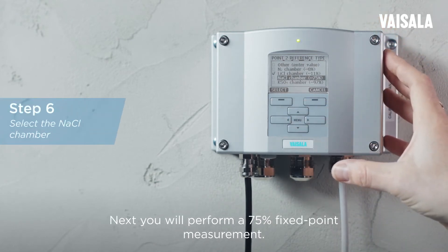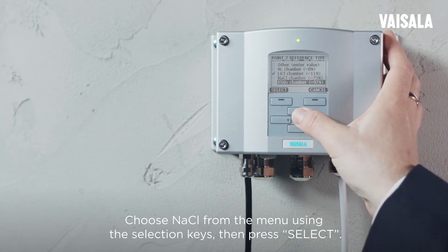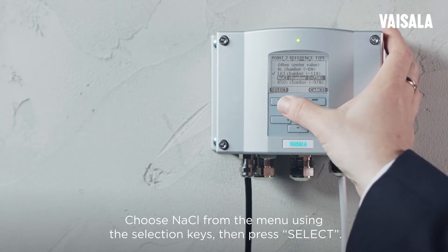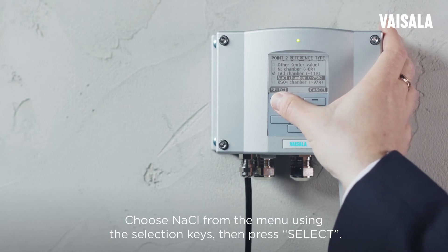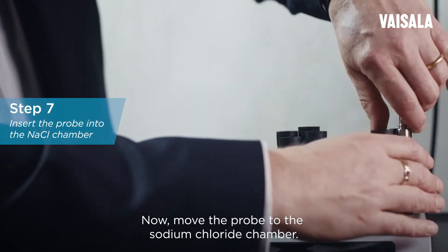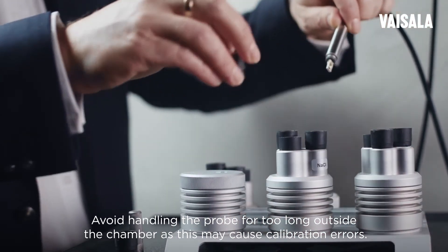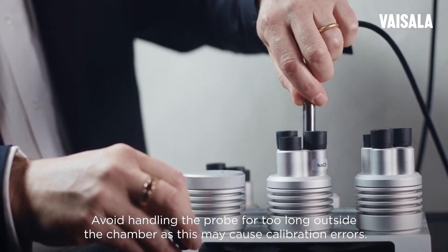You will perform a 75% fixed point measurement. Choose sodium chloride from the menu using the selection keys, then press SELECT. Now move the probe to the sodium chloride chamber. Avoid handling the probe for too long outside the chamber, as this may cause calibration errors.